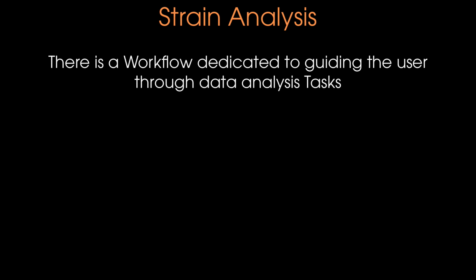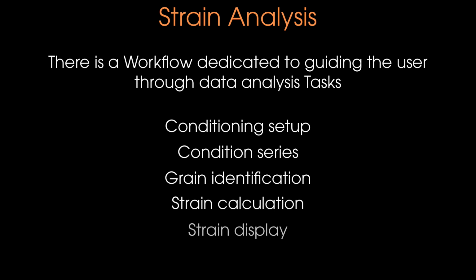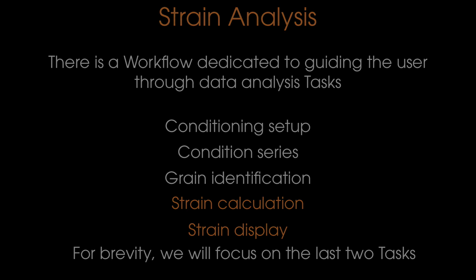The Topspin strain analysis workflow has 5 tasks: conditioning setup, series conditioning, grain identification, strain calculation, and strain visualization. In the interest of time, we will illustrate the last 2 tasks of the workflow.